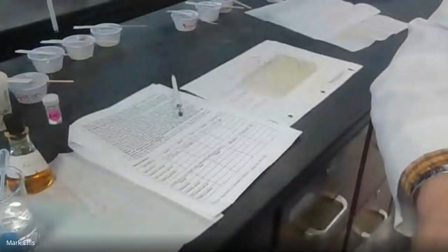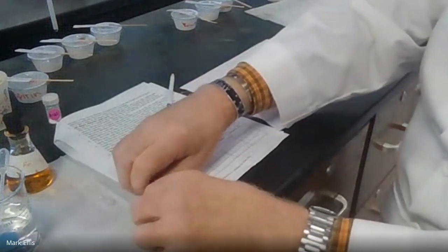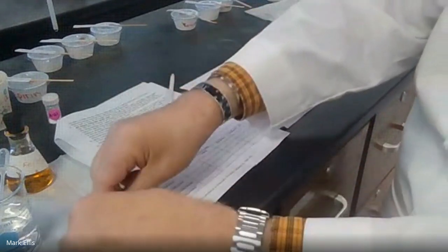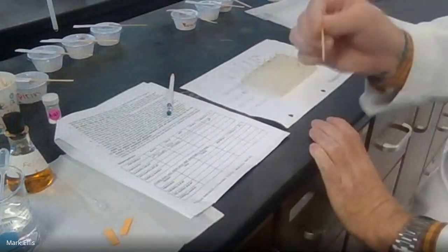All righty. So now the next is we're going to test the pH of each of those. So there's 5 wells, so probably 3 pieces. And make sure your fingers are dry and clean when you grab this pH paper out. And maybe one of your lab partners can do that. And we can just tear these in half. That's more than enough. Okay. I want to get a clean Q-tip and use a clean Q-tip for each hole. Don't just go across. Clean one in each hole.